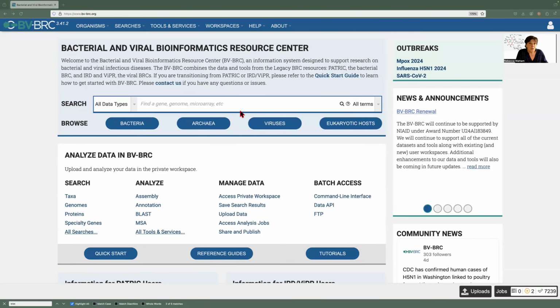Okay, we've submitted our binning jobs. Now we want to look at some of the results. There are a number of ways you can get to a completed job in BV-BRC. You could go to the jobs page by clicking on the jobs monitor down here at the right.